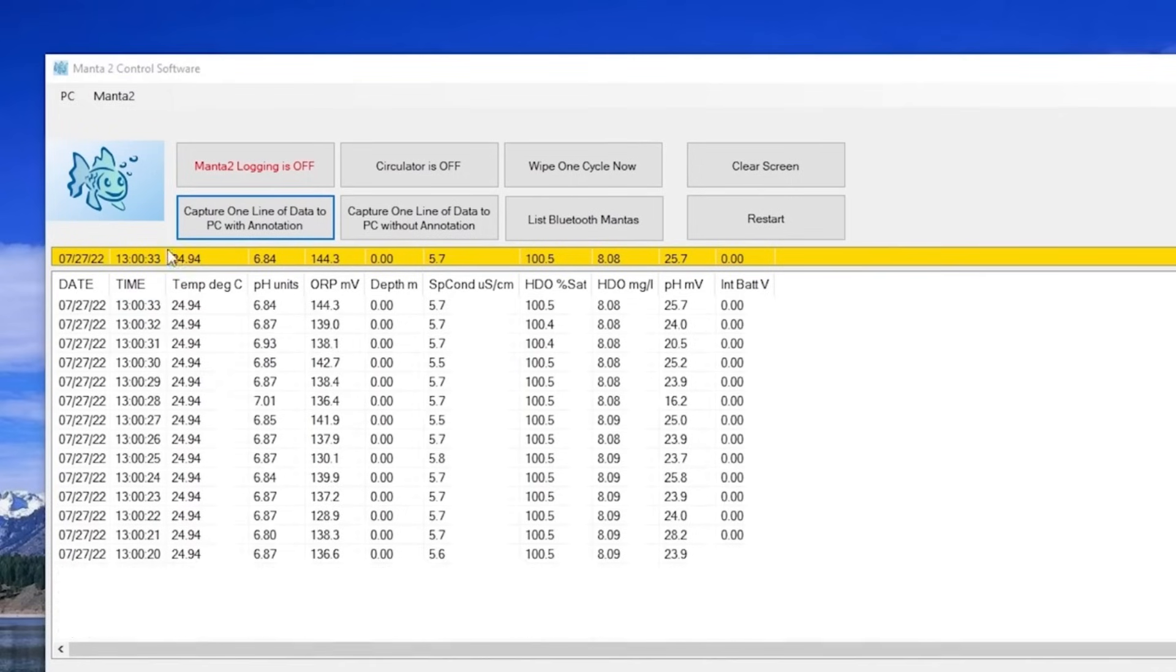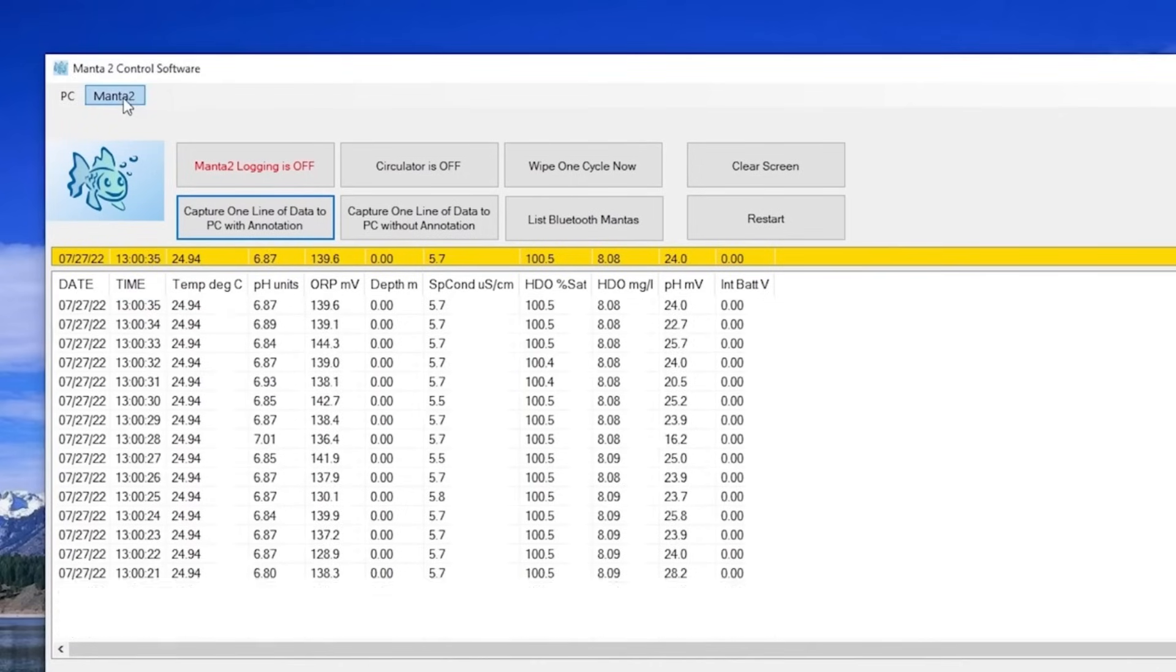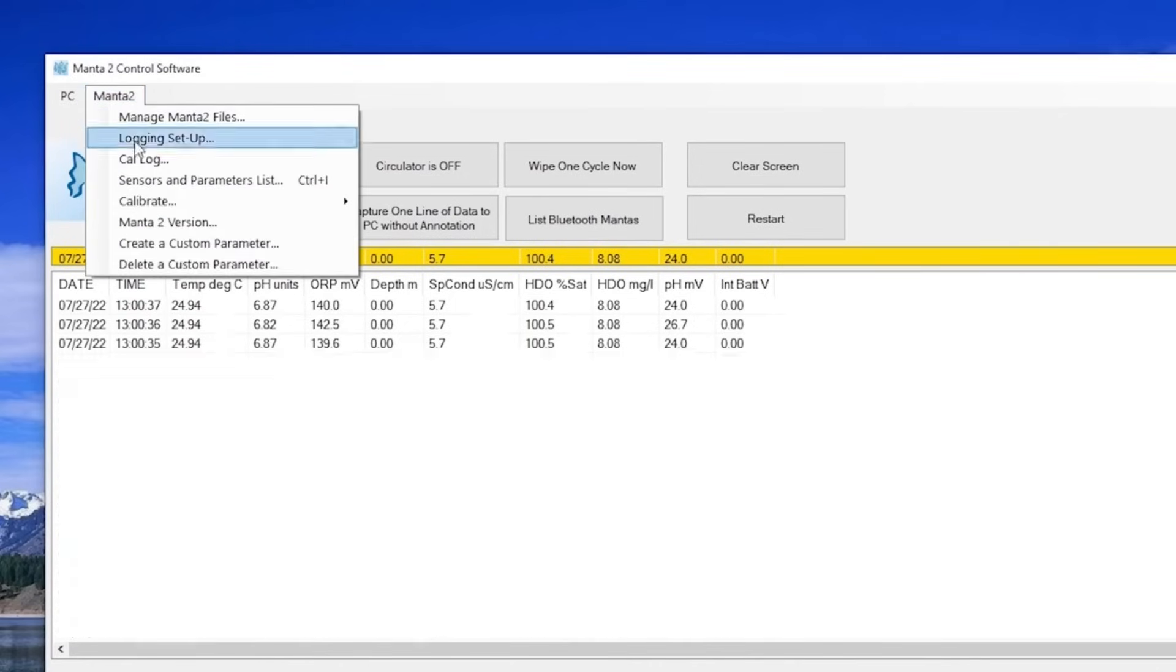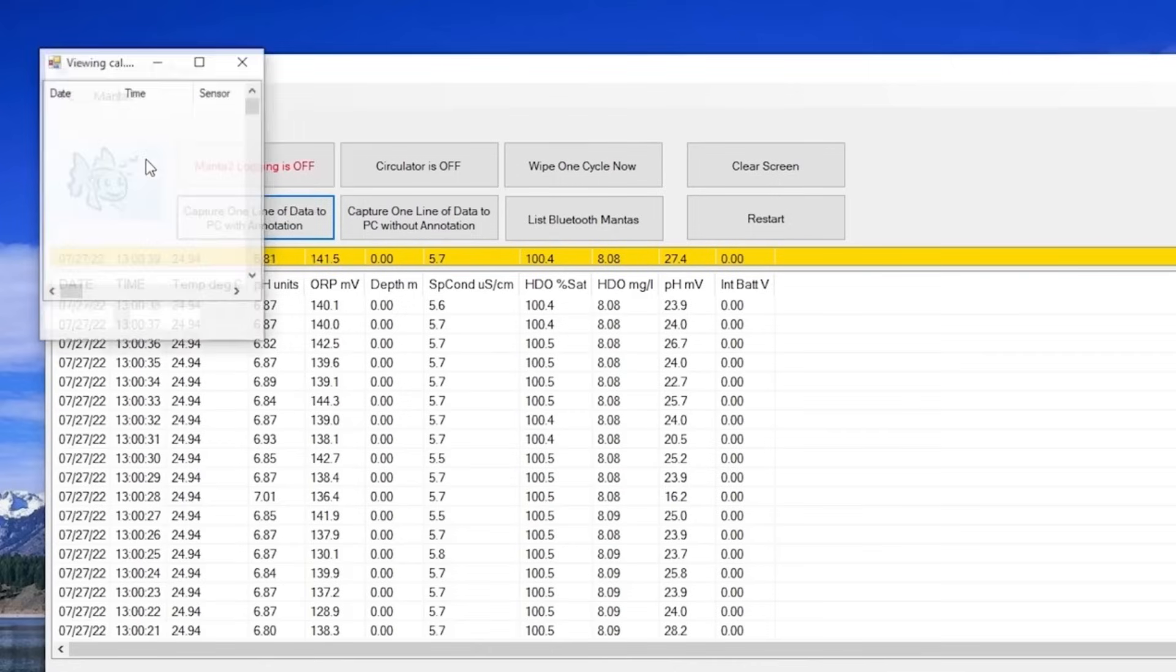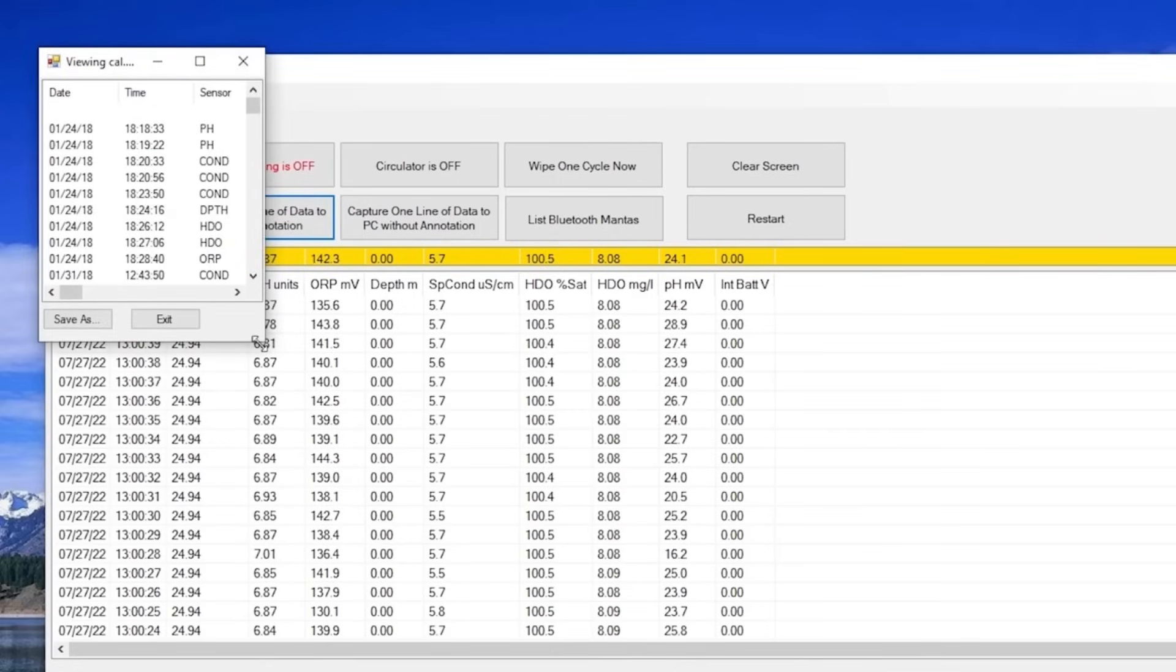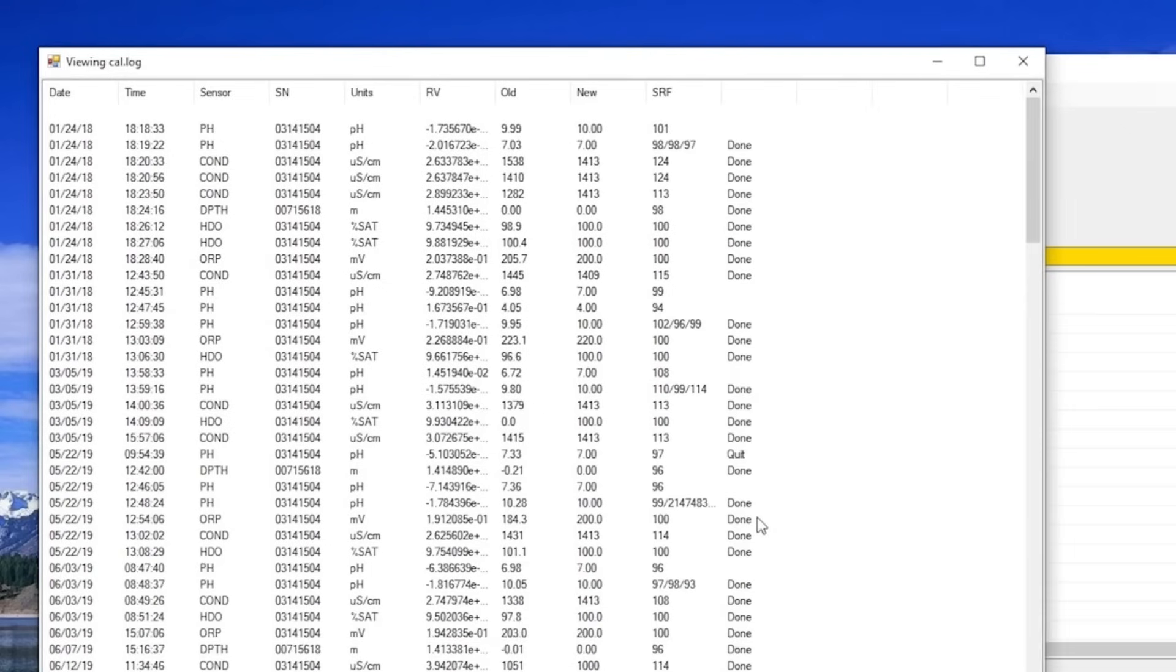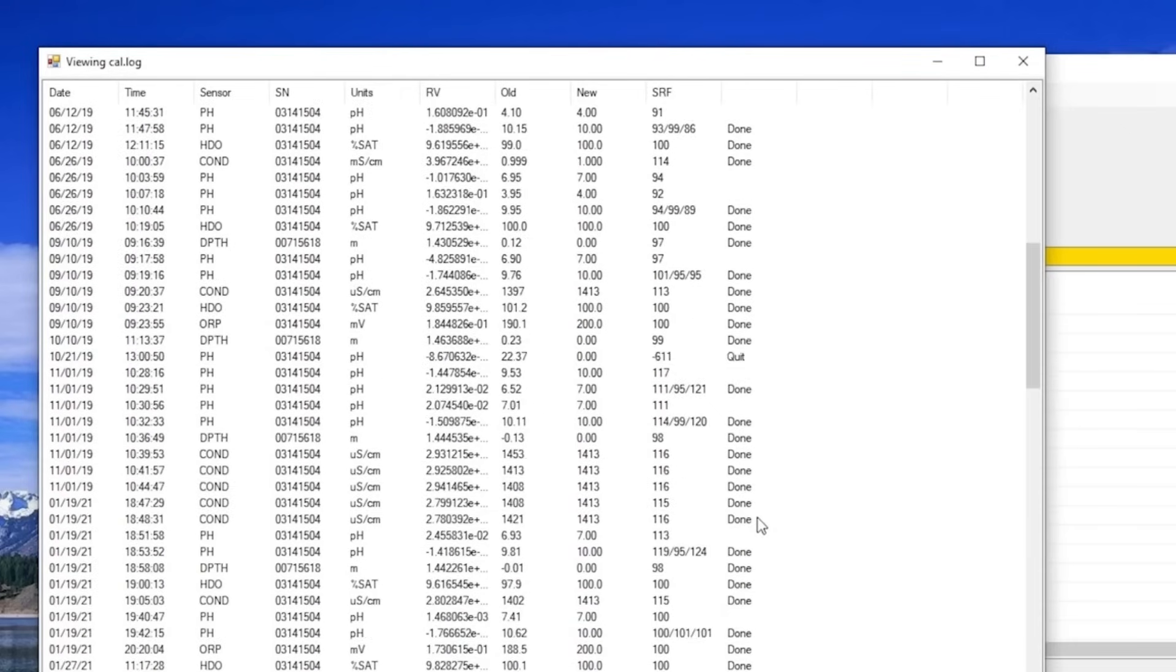Note that your calibration has been stored in the Manta's permanent calibration log, which you can see by clicking the Manta 2 pulldown, choosing Cal Log, and all of the information from any previous sensor calibrations are stored there.